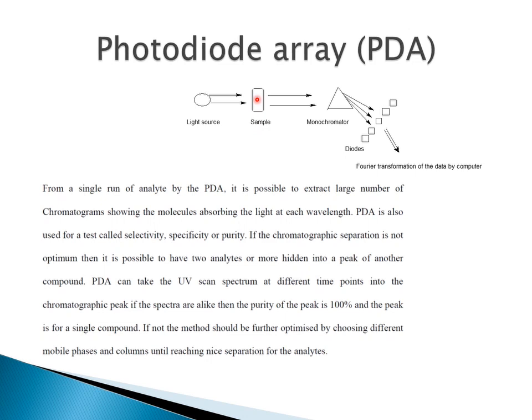The UV spectrum will depict that the sample absorbs certain wavelengths of light, not the whole range. The same idea here: the analyte in just a millisecond will absorb what it needs from the whole light radiated from the light source, and the rest of the light will be resolved afterwards by monochromators such as a prism or grating. And usually, to be honest, we use gratings to gain better resolution.